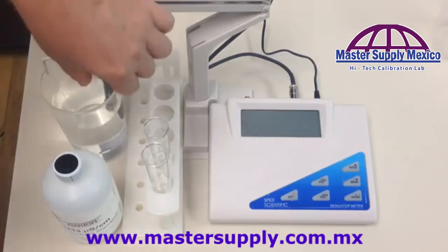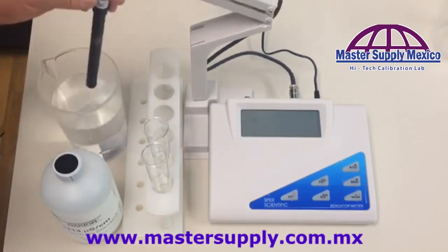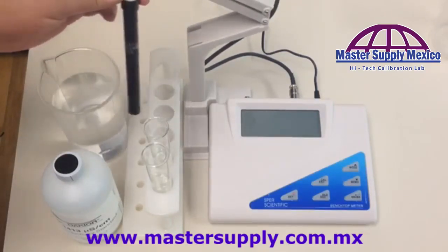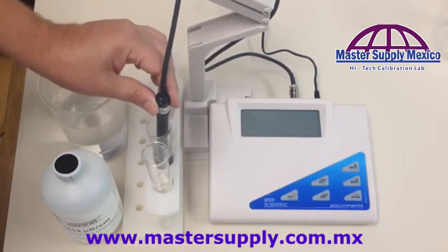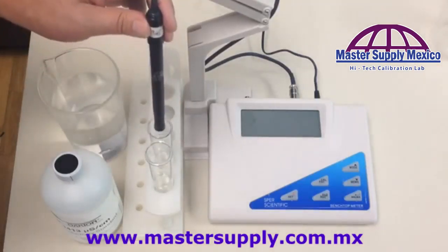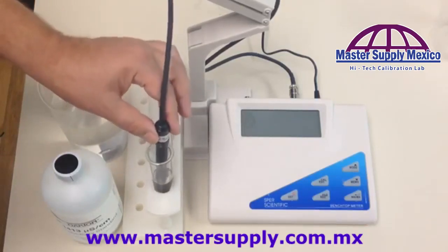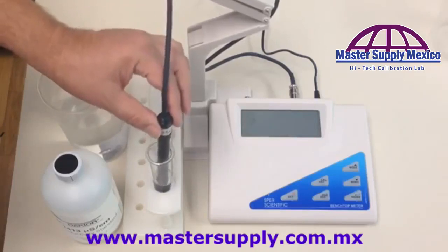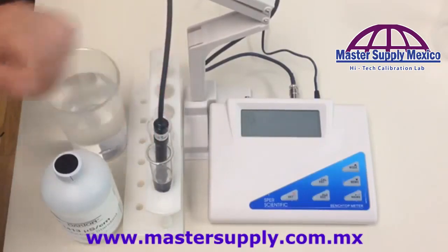After the probe has been sitting for 30 minutes, take your probe, tap out the distilled water to eliminate as much contamination as you can, put it into your first beaker, swish it around a little bit, tap it out, then put it into the second beaker. This is the one you're actually going to be calibrating from. Make sure you get all the air bubbles out of the probe.